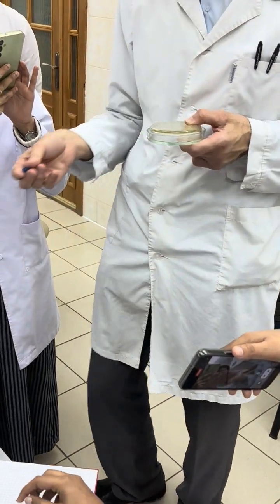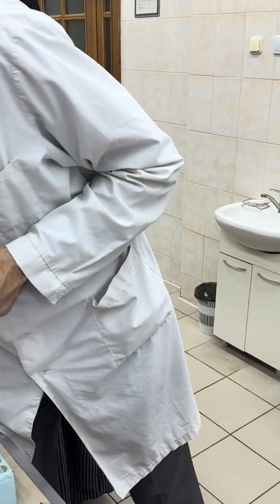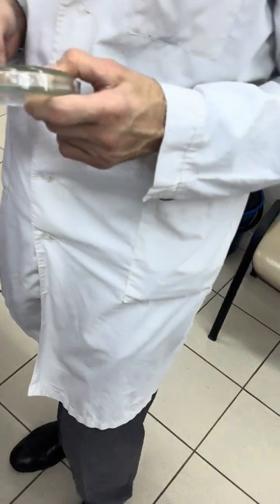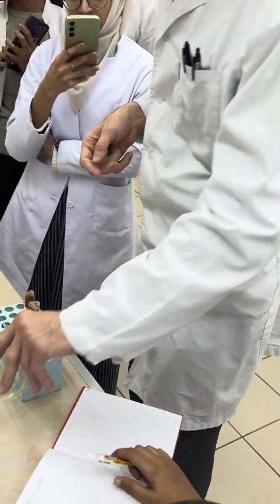Maybe to change. Red color is better. Oh yes. So encircle this colony and put it apart from you.